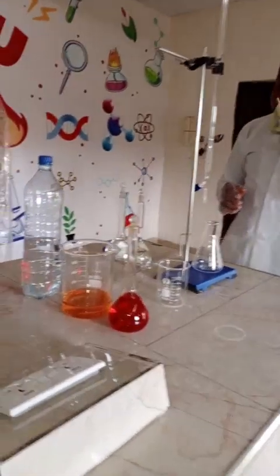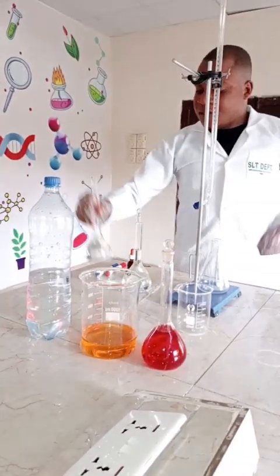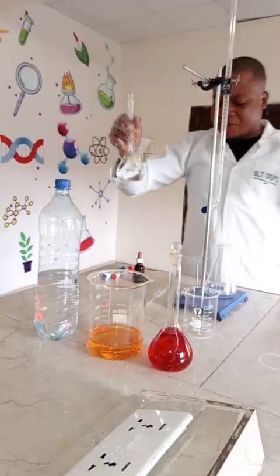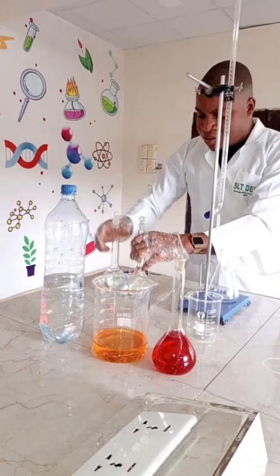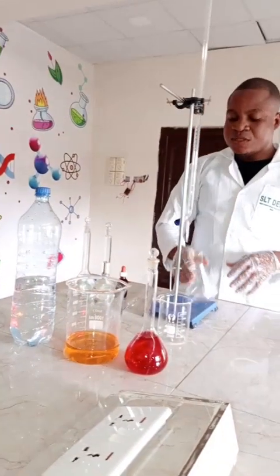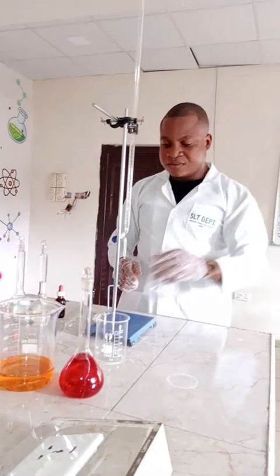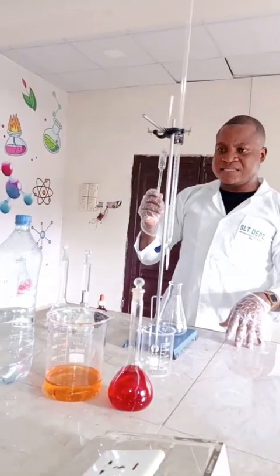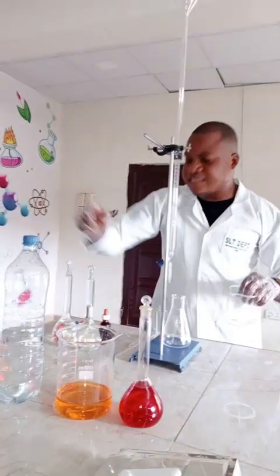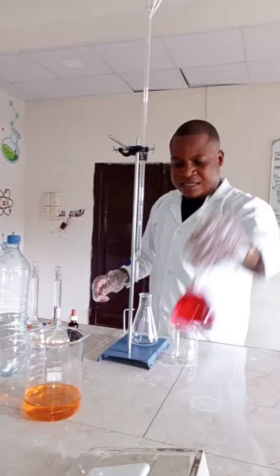Now this is our workbench. The solutions are already prepared. Here is our HCl acid. Here is our sodium hydroxide. Here is our indicator, the material. Here is our titrating flask or the conical flask. Here is our pipette. Here is our beaker, and this is our distilled water. This is my stock solution for my material.